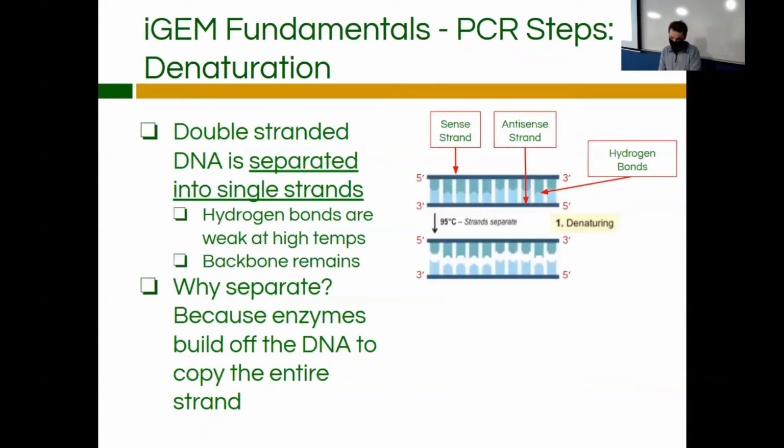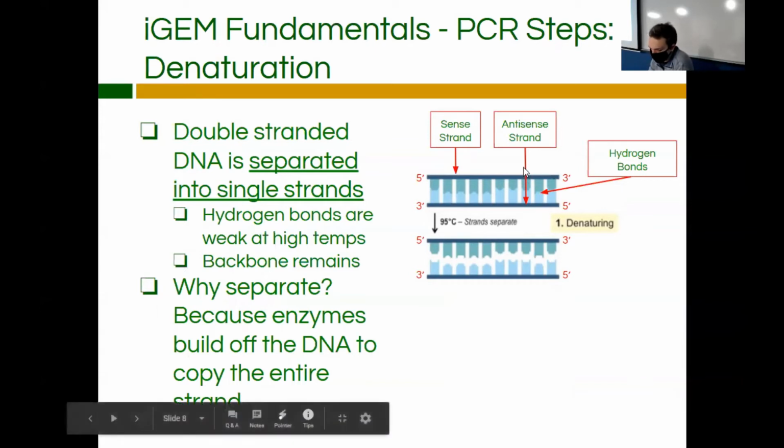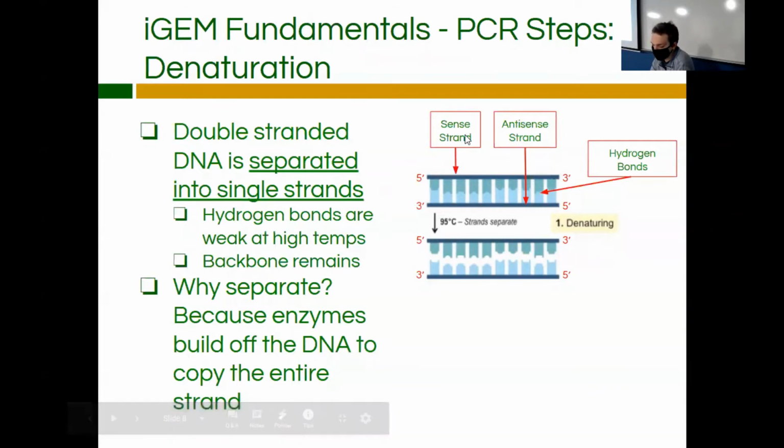Okay, so the first step is denaturation. And it starts with your part of interest. So if you remember, these are called different things in regards to whichever protocol you're using. But in this protocol, this is called the sense strand, and this is called the antisense strand. It could also be like the coding strand or the template strand, depending on, you know, if you're going over transcription or translation. And in the denaturation protocol, your part is separated, so the hydrogen bonds are broken between each of the nucleotides, and it's separated into 2 single-stranded segments.